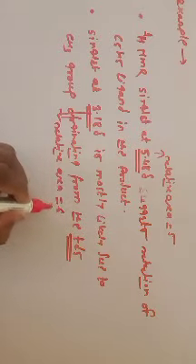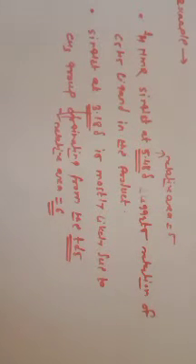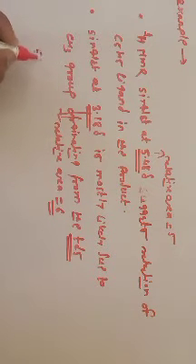The relative area indicates the number of protons. So a relative area of 5 means a total of 5 protons, and a relative area of 6 indicates a total of 6 protons.